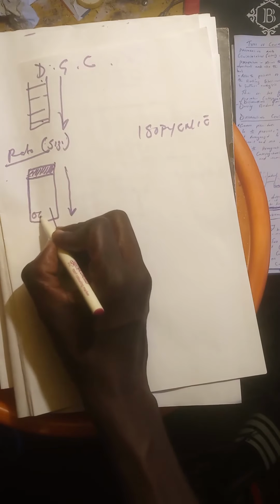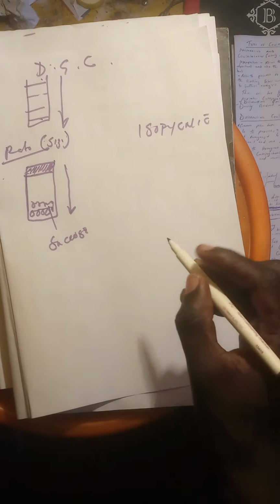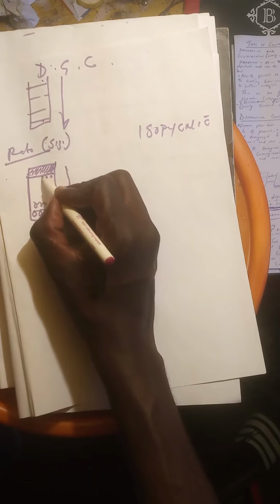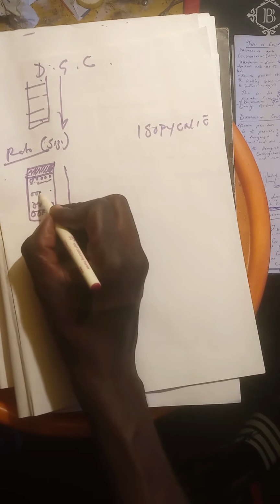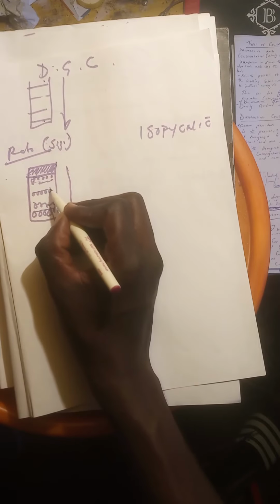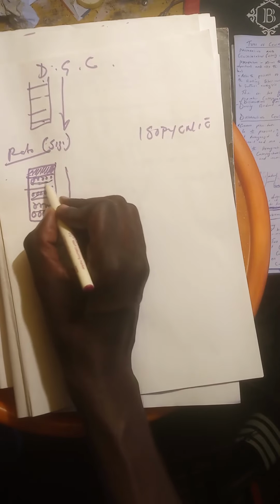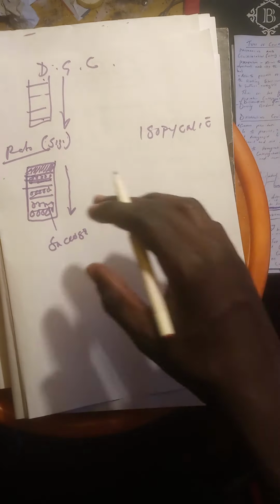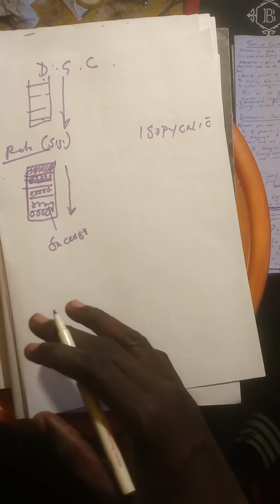You have larger components at the bottom there because they are denser, and you have maybe less dense components as a supernatant there on top. Then those which are maybe there on the middle will settle on the middle. So you have different bands forming, or zones. That's why it's called rate zonal. You have zones forming at different locations.